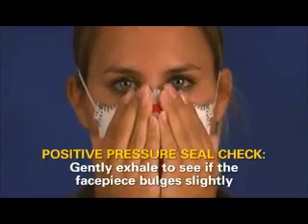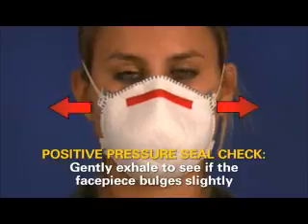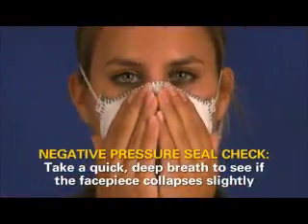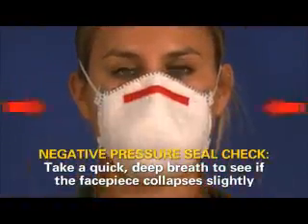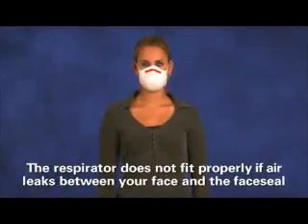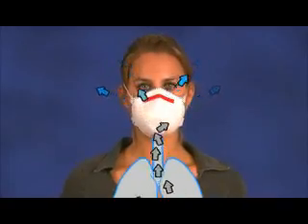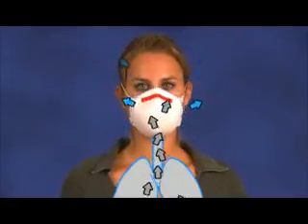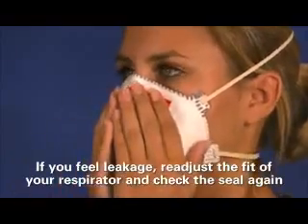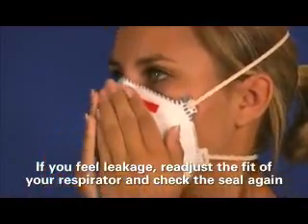A positive pressure seal check is performed by gently exhaling to see if the facepiece bulges slightly. For a negative pressure seal check, take a quick deep breath to see if the facepiece collapses slightly. During either test, if air leaks out between your face and the respirator's face seal, the respirator may not fit your face properly. One way that you can identify leakage is if you feel air blowing through the seal onto your face or eyes. If you feel leakage, readjust the fit of your respirator and check the seal again.